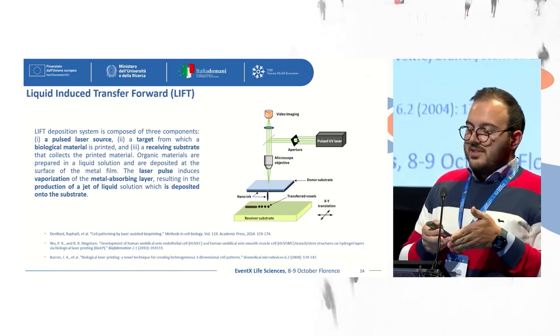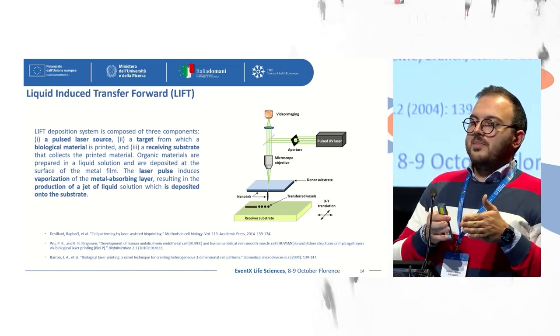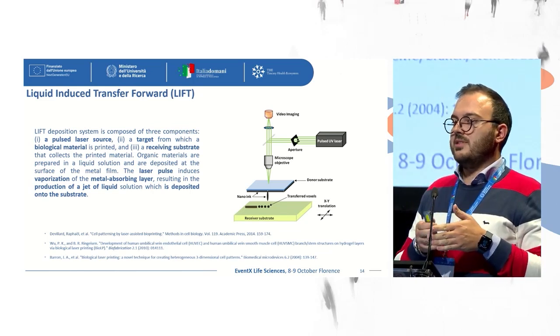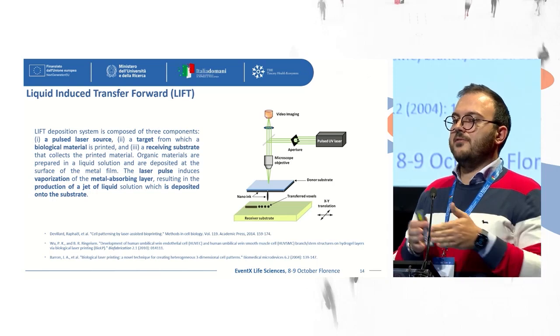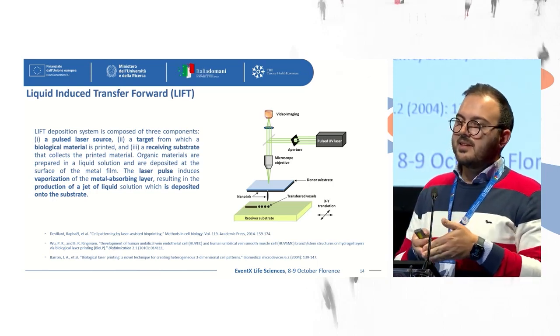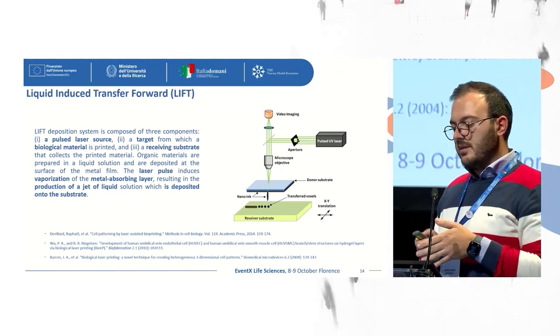The disadvantage of this technology is that there is not so much material that can be used. So the extrusion approach is the one that allows us to test different materials. There is a bigger amount of materials that can be processed. Instead, in this case, not so many materials can be used.